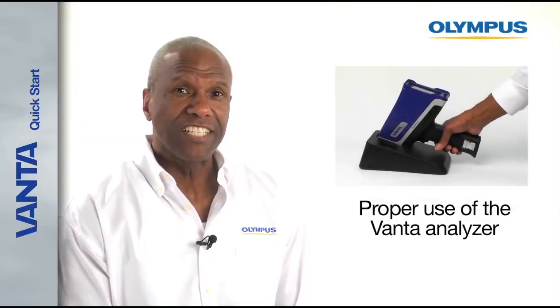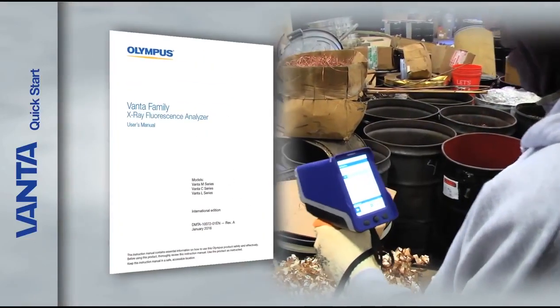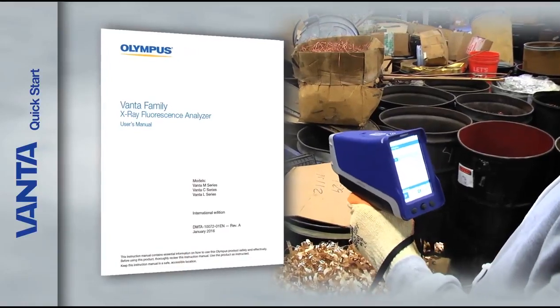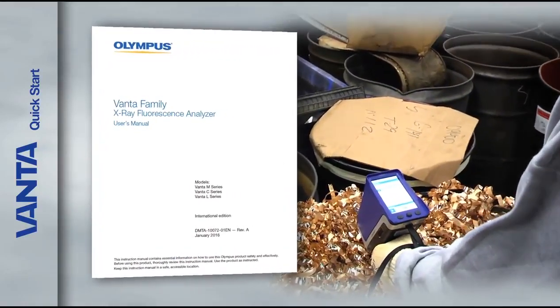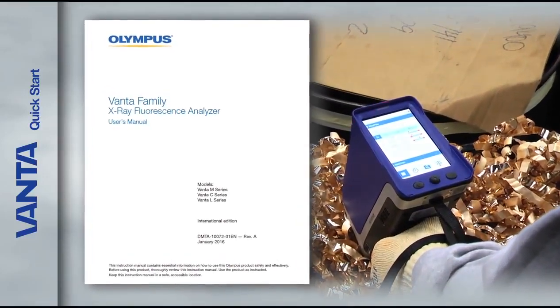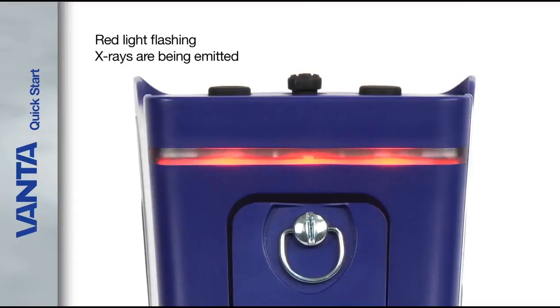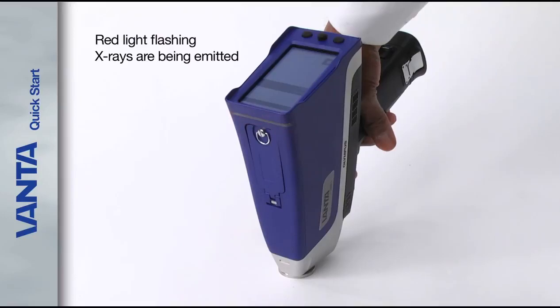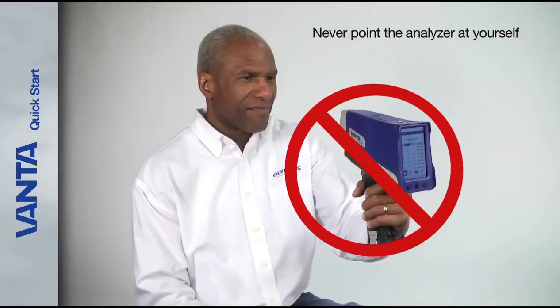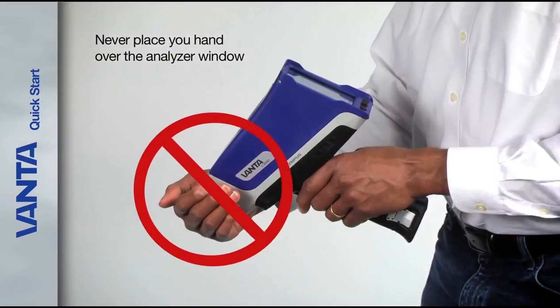Let's discuss proper use of your Vanta XRF Analyzer. Before using your analyzer, please review the user manual. Our instruments are safe and dependable when used correctly, so it's important to thoroughly review the user manual to ensure best practices so that you and everyone around you will be safe. When the red light is flashing, X-rays are being emitted. Never point the analyzer at yourself. Never point the analyzer at anyone else. Never place your hand over or near the analyzer window.